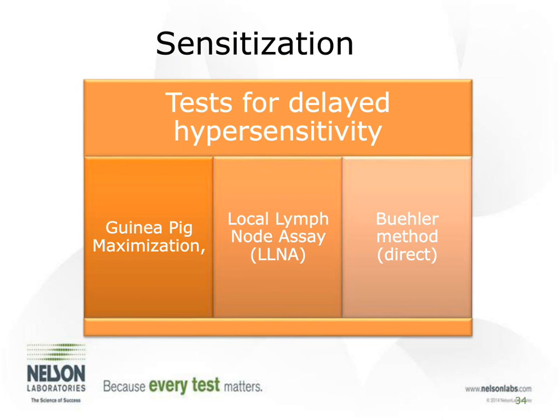So the thought would be going forward, if we can prove this to the regulatory agencies, that the in vitro method would be used as a screening method for the irritation. If you do see some irritation in the in vitro test, either with the interleukin test or the MTT test, then that would trigger you to go into an animal verification of that failure. Even though we believe that the in vitro irritation is more sensitive based on studies that we have done, there's not been enough data to overwhelmingly call the in vitro irritation more sensitive, and that's what we're hoping to gather, so that we'll be able to present a good case to all regulatory agencies across the world that this alternative is a viable alternative. The turnaround time and cost for this test could be much less.